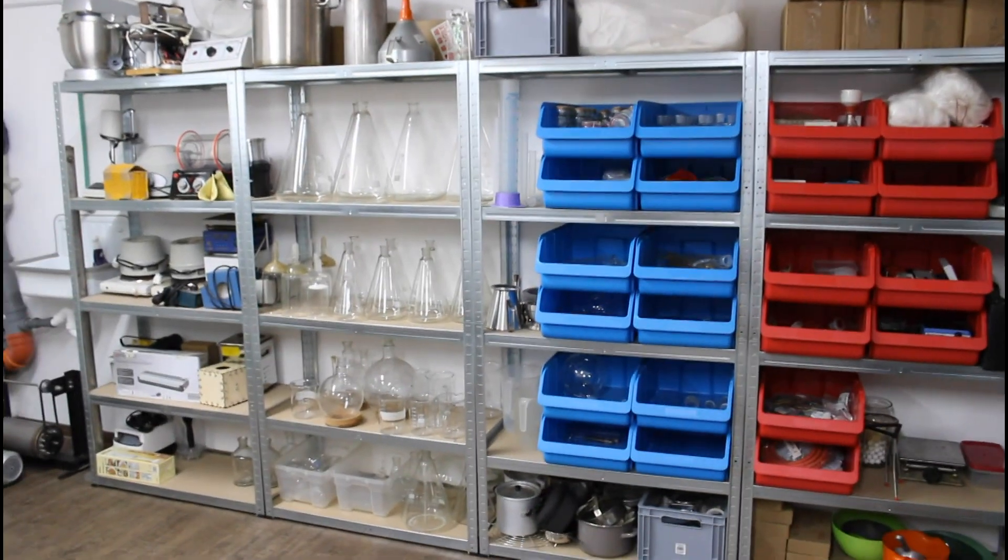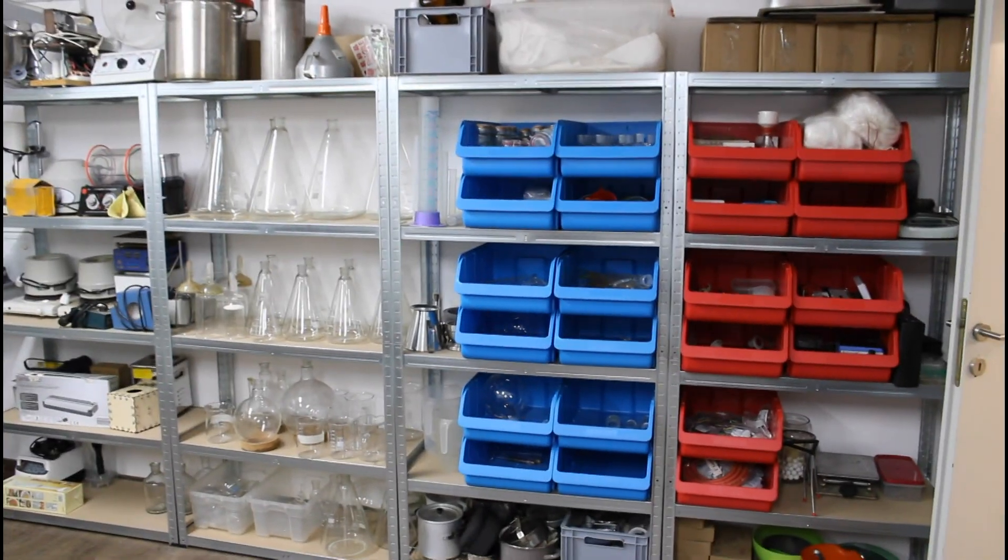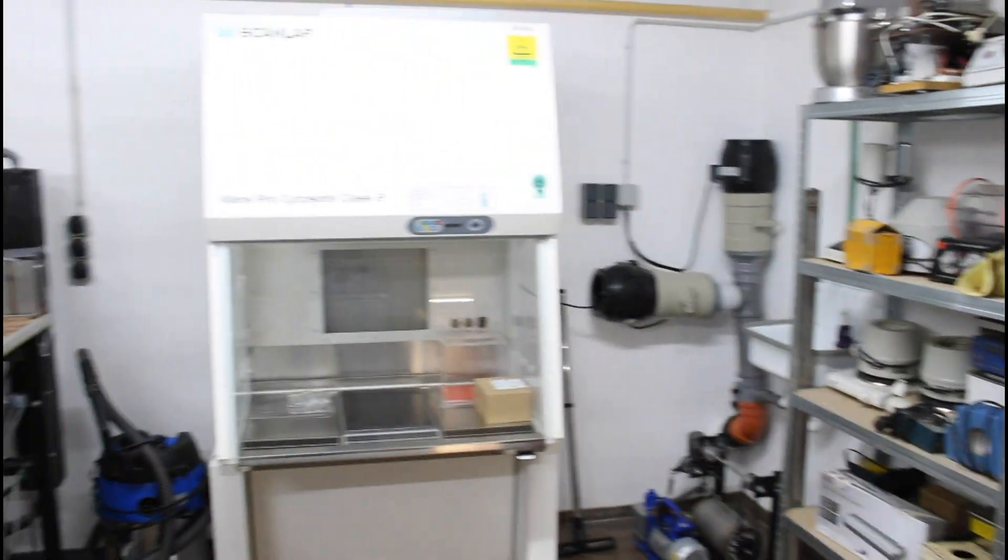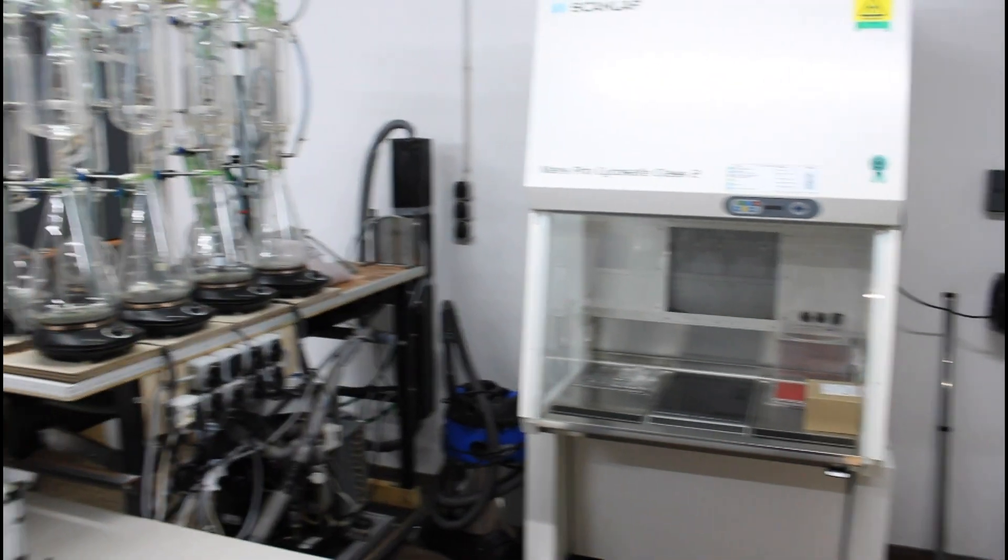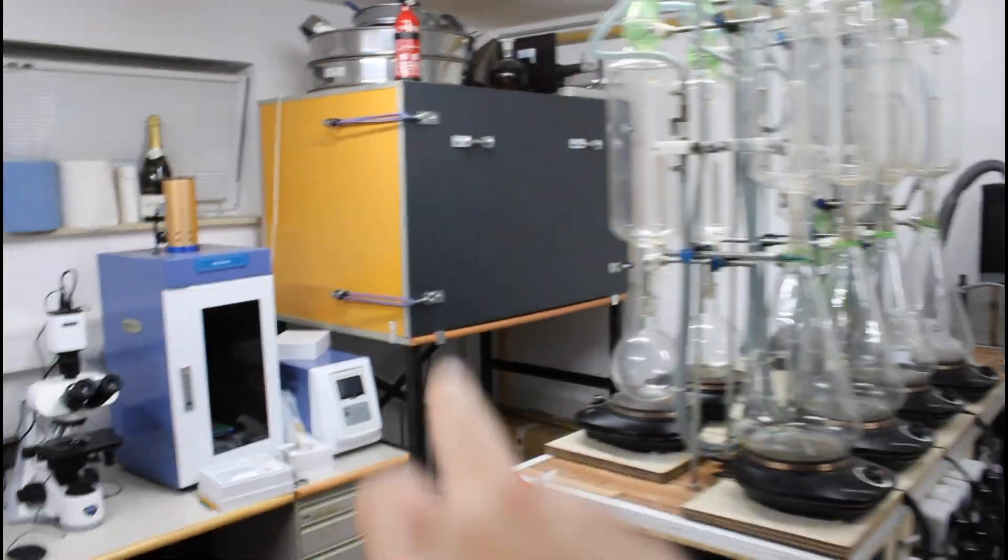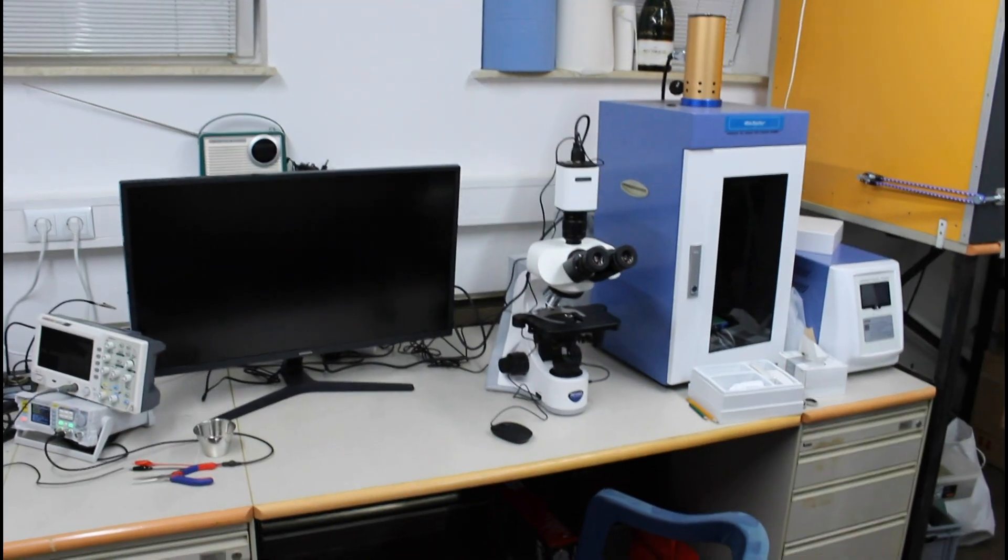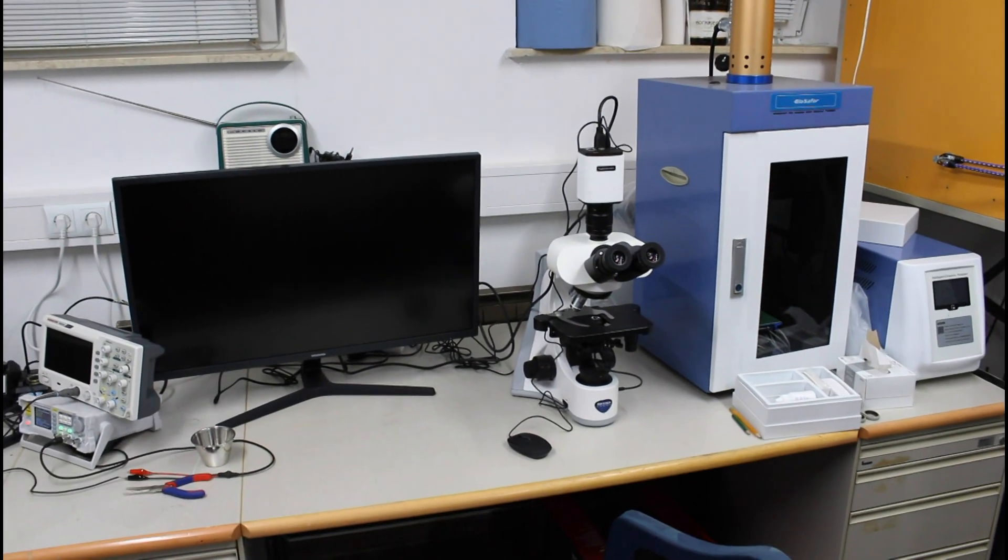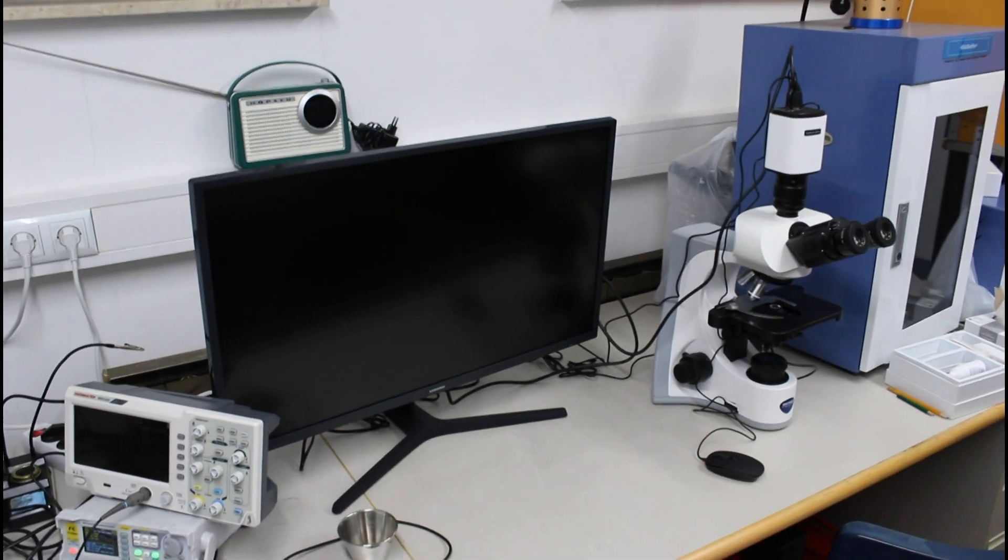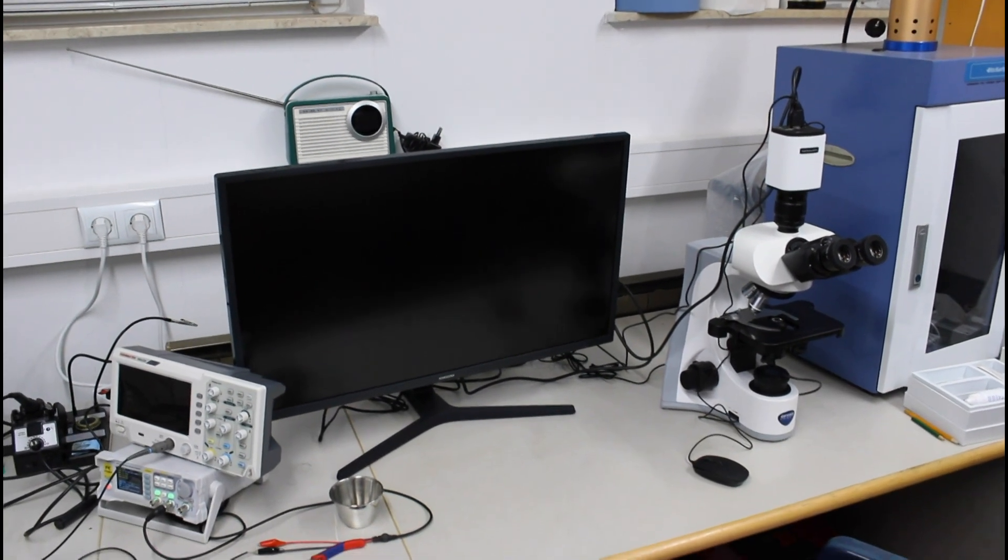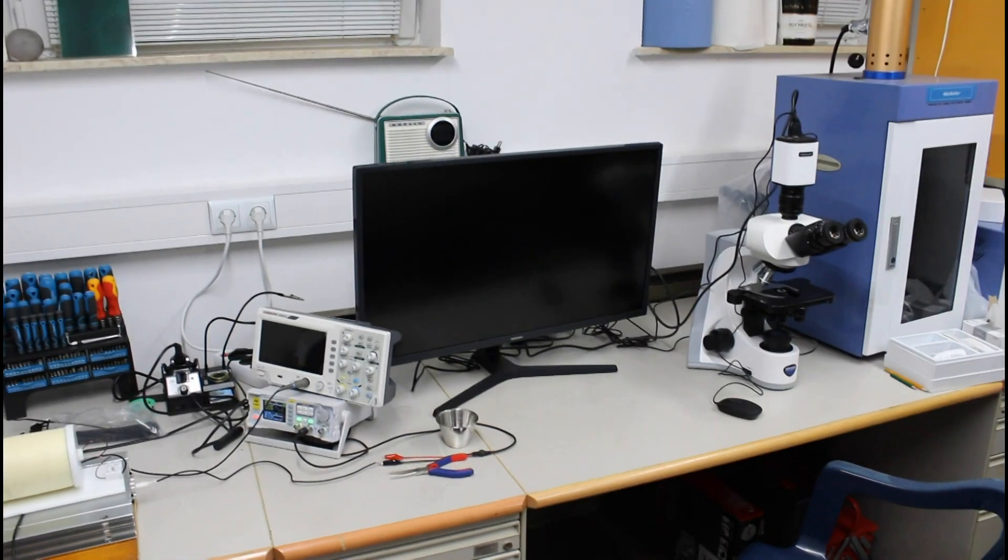Before we start, I want to give you a quick overview of my new laboratory. What you see here is the glassware and instrument corner. Now we move on to my new laboratory workbench, and here we're coming to some extraction device. In the background is the alchemy corner with some high temperature stoves, and there we go, that's the dark field corner. This dark field microscope is really a very good one - I paid 5,000 euros for it. And here is the electronics corner.